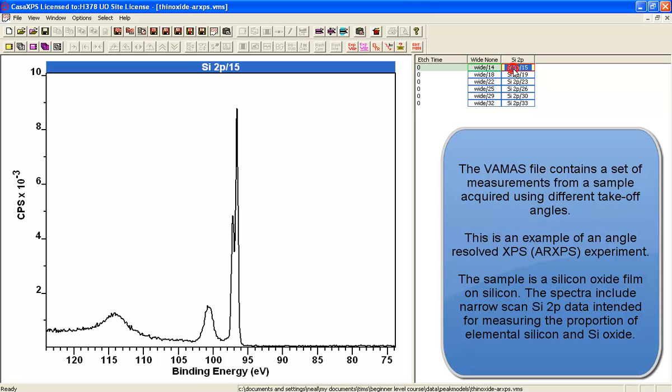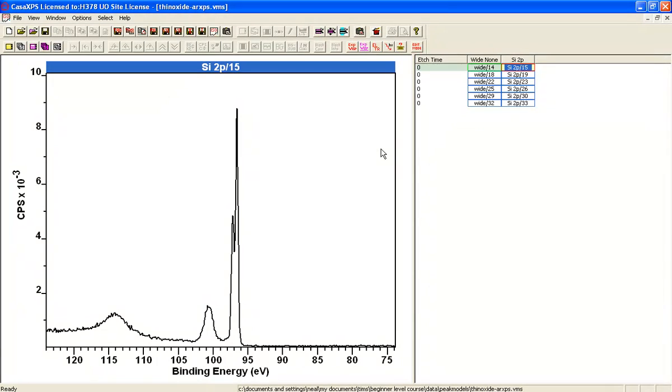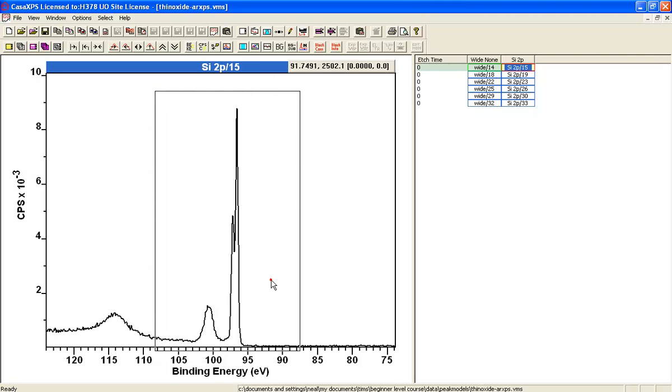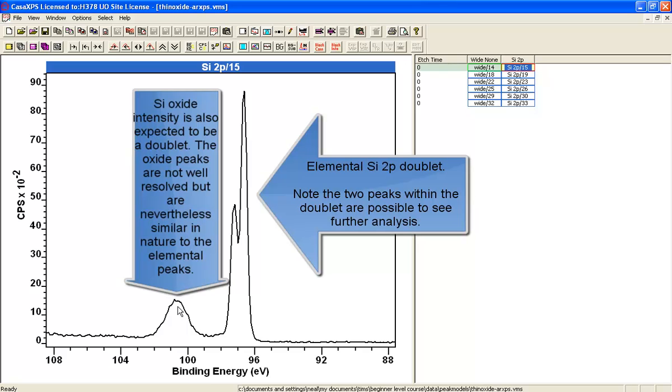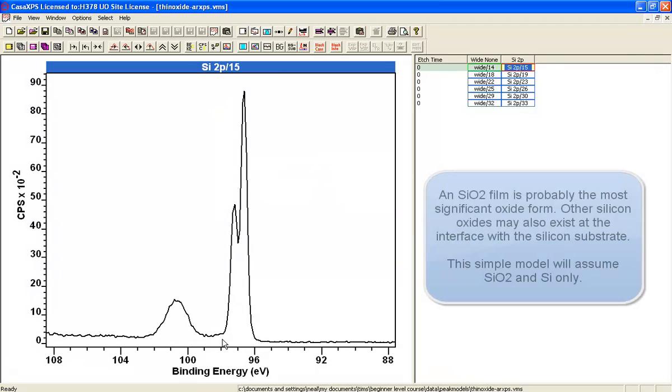We will create a peak model for the silicon 2p spectrum you see here. This is a nice simple one to start with because we've got an elemental peak and an oxide peak, and we need to create at least two doublet pairs, possibly more, to represent these data.